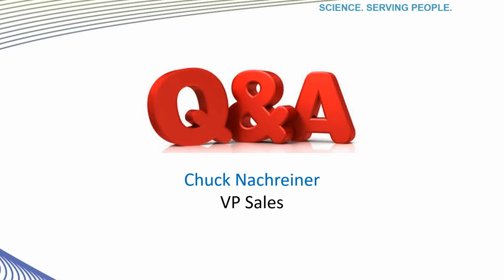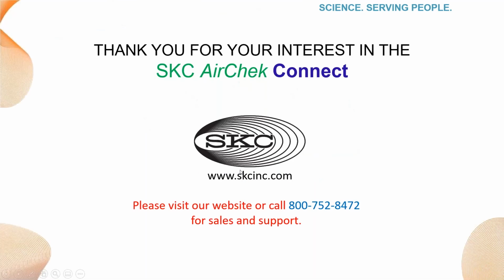Second question. There was also a question about explaining a little bit more about the constant pressure and constant flow modes of this pump. I'll go ahead and take that one too. So constant flow is typically the way people run pumps above 500 mils a minute. And typically when you're above 500 mils a minute, you are sampling with a filter cassette. In theory, as you add particulate to the face of that filter cassette, you're adding back pressure. That pump needs to compensate for that.